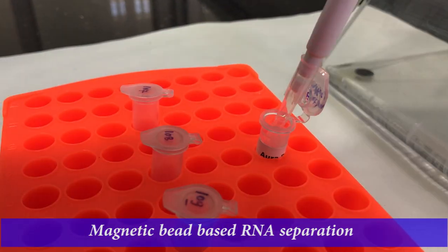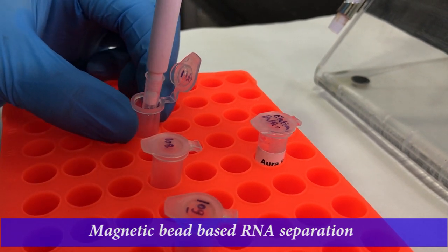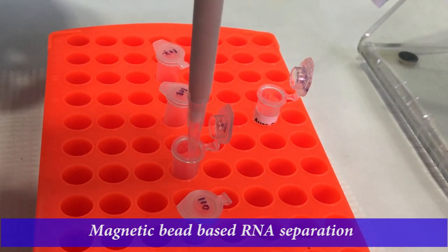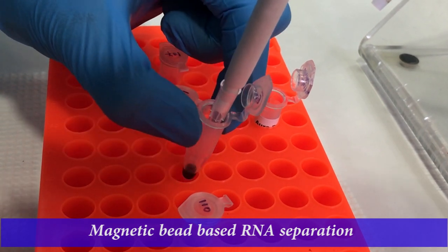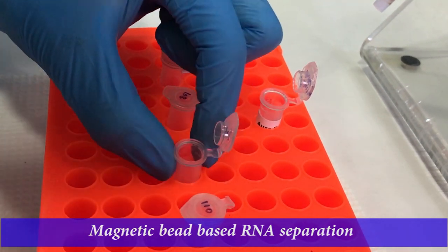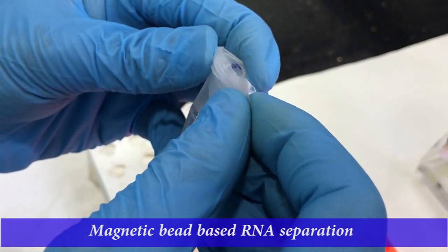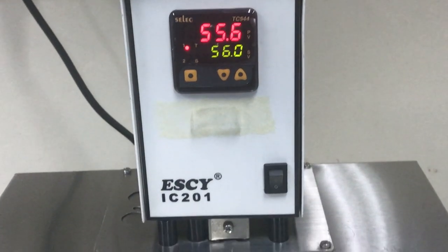For elution of RNA, add 60 microliters of the elution buffer provided in the kit to the respective tubes and mix well. Seal the tubes with parafilm and incubate at 56 degrees centigrade in a water bath for 5 minutes.